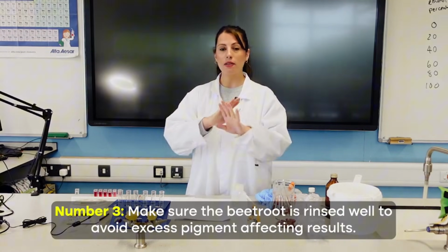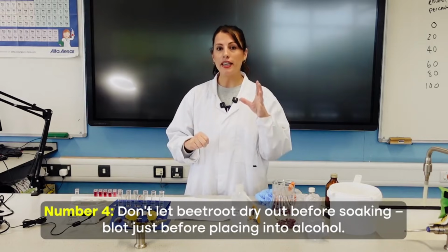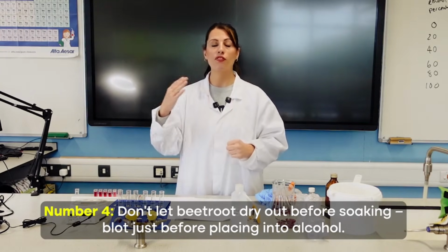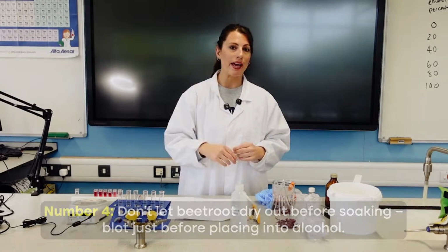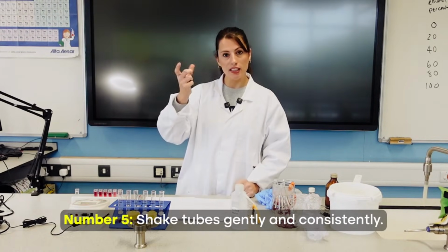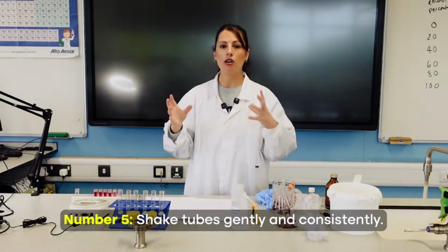Number 3, making sure that the beetroot is rinsed and then patted dry after cutting. Number 4, don't let the beetroot dry out before you do the experiment, so you do need to prepare the discs and then use them straight away. And number 5, making sure that you do shake them consistently like we saw at the end, so you have that equal distribution of the pigments.